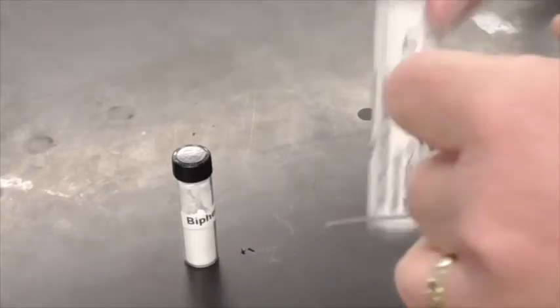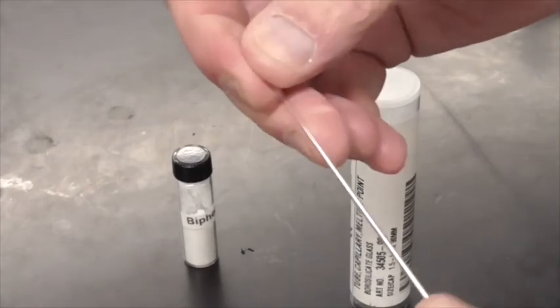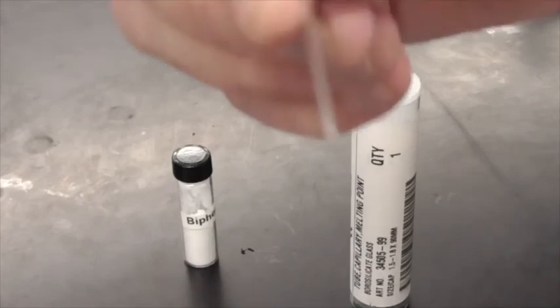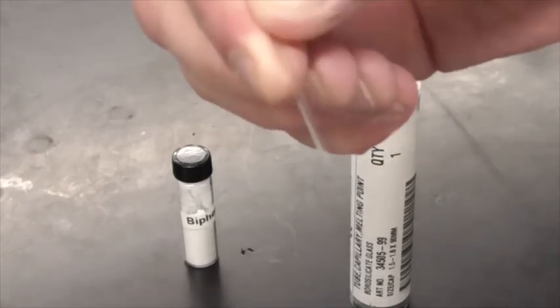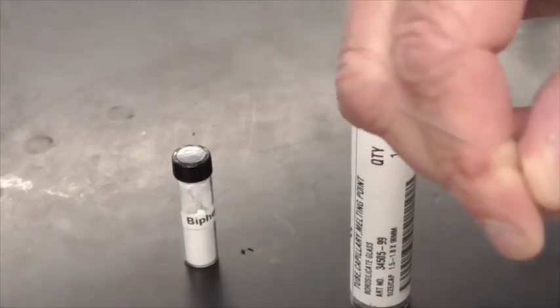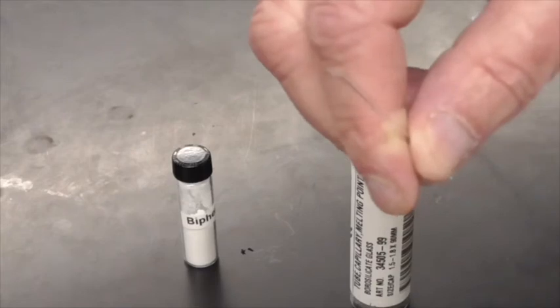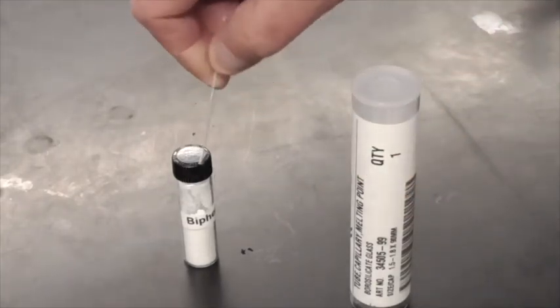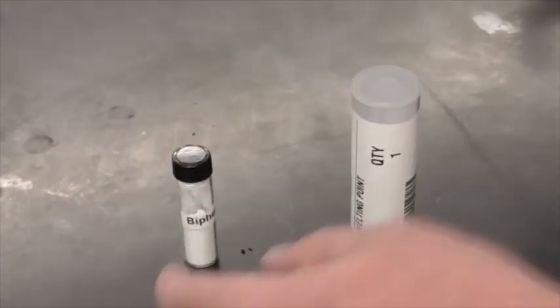And in this case, there you go, let me show you. So we've got a little glass tube here. And in this case, you can see maybe one end is sealed and the other end is open. Okay? And what I'm going to do is put the open end into the biphenyl and kind of push it down in there a little bit so I get some of the biphenyl into the end of the open tube.